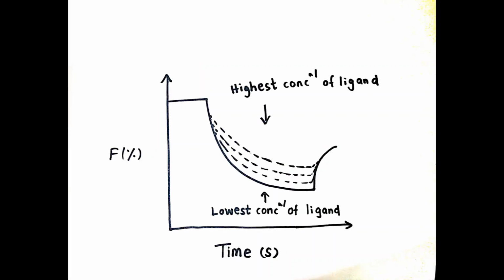Don't you worry now, the instrument does not force you to run experiments 16 times each time. You can stop whenever you like. Ideally, you can end up with 16 curves or less. Highest concentration is at the top and lowest concentration is at the bottom because unbound molecules move faster and further away than the bound molecules.